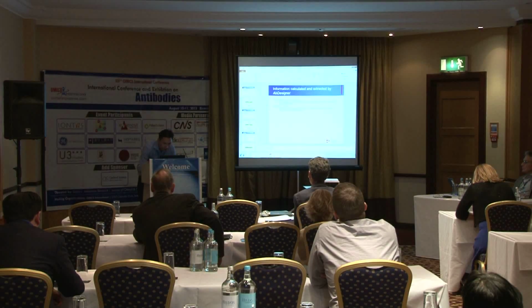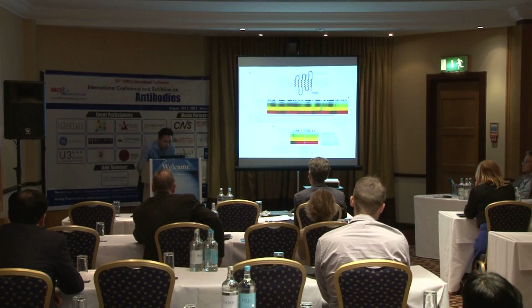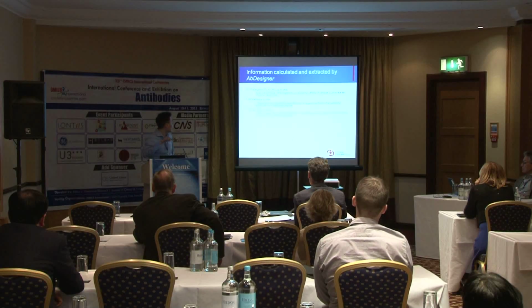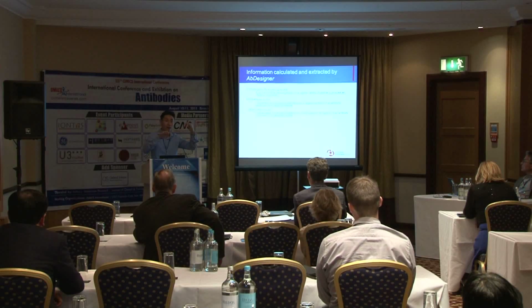Okay, going back here. So what else is reported to you? Uniqueness, okay. Another useful feature is conservation. It compares the peptide, let's say human, against mouse and rat.